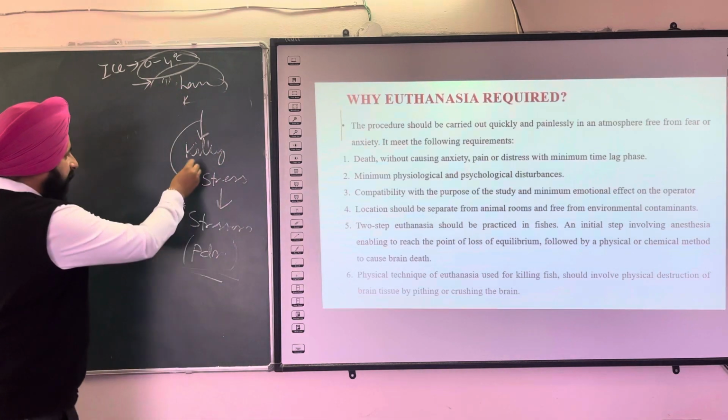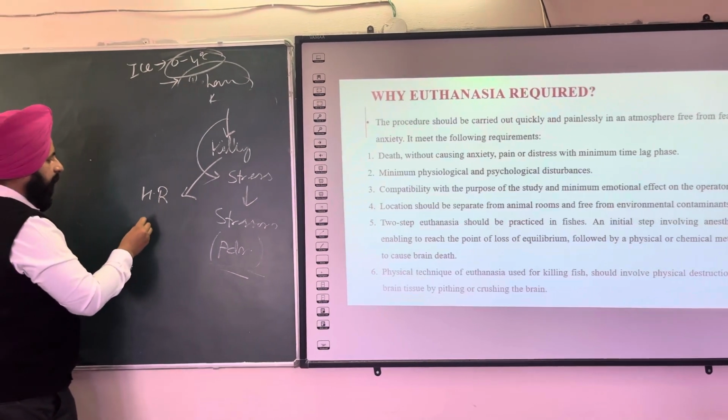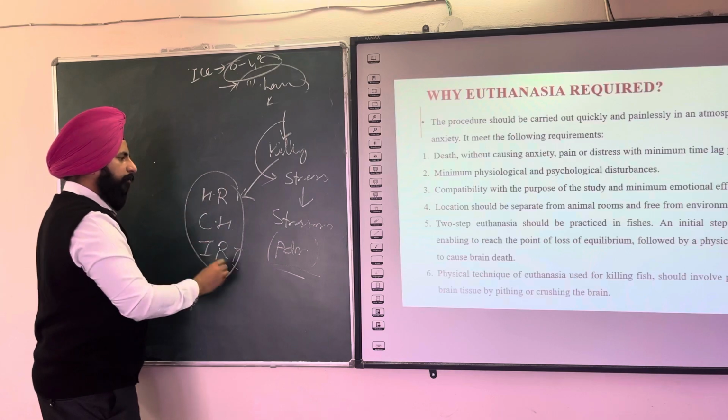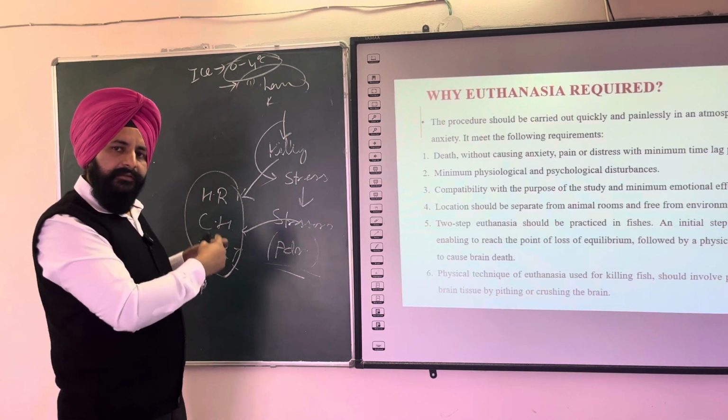Your interventions are to check the heart rate, cardiac hypertrophy, or ischemia reperfusion injury.